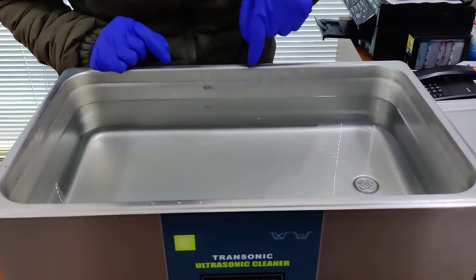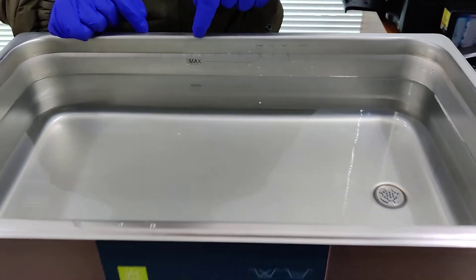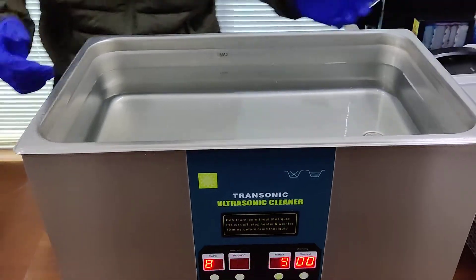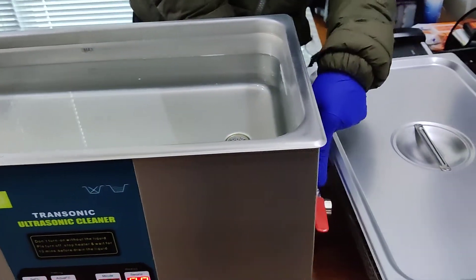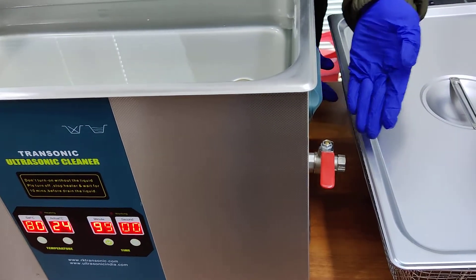The machine has an indication for the maximum water and the minimum water that has to be in the machine before the cleaning process. The machine also comes with a drain valve so that we can easily remove the water or the solution after the cleaning is done.